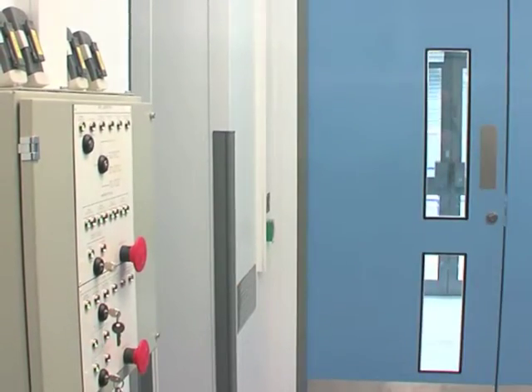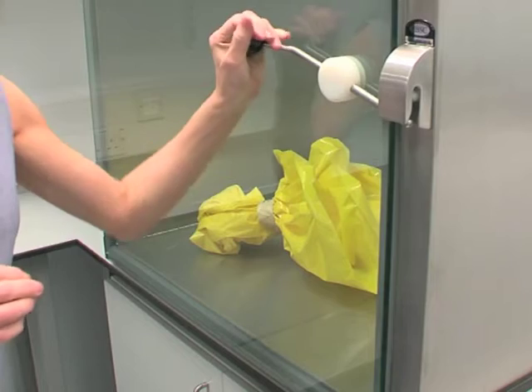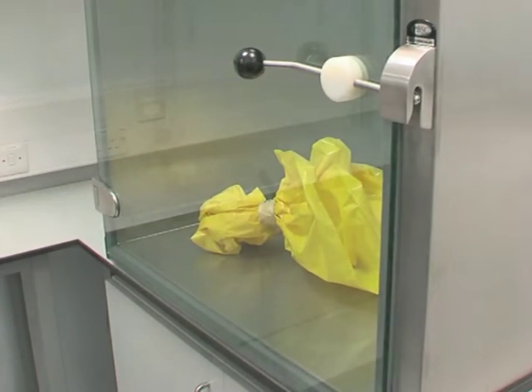The reception or lobby area houses a manned control room where all personnel are required to sign into the entry logbook and check on who else is working in the facility. Where appropriate and if available, prior to entry, staff should check the pressure dials and warning lights to ensure that the facility is functioning correctly. Any consumables, equipment or specimens required are passed through a double-doored pass hatch or fumigation chamber.